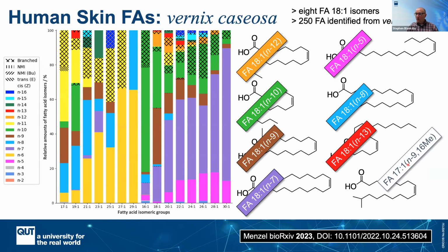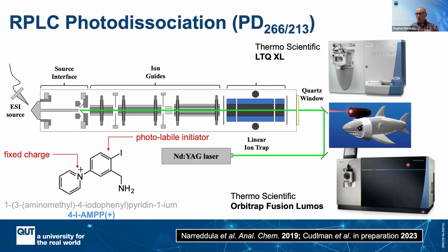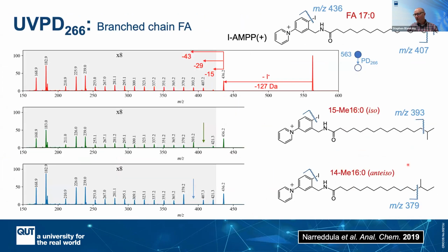So what's interesting about this is, you know, the human sebaceous system, again, is making them. This is not a perversity of cancer or something else. This is in the repertoire of human lipid metabolism. And the last point is, we still need to keep driving the technology, because not only do we need to now know the double bond positions, but we need to be able to identify the sites of chain branching, because it's another variation, another isomeric motif.